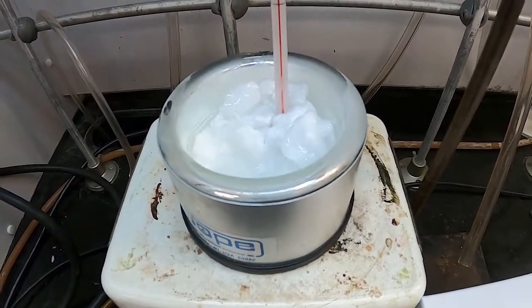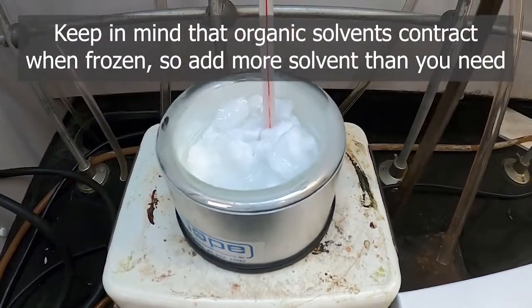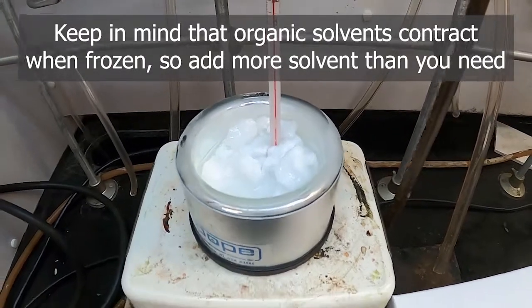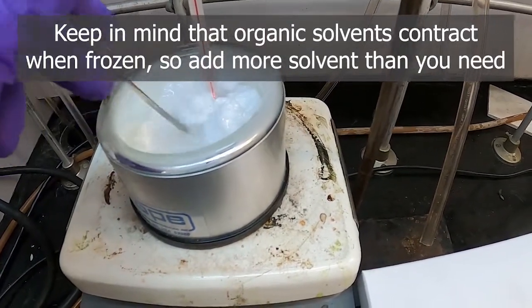You're starting with a little bit more solvent than you think you need. It seems that generally they shrink when they freeze, unlike water, at least for organic solvents that you would use for this kind of a thing.